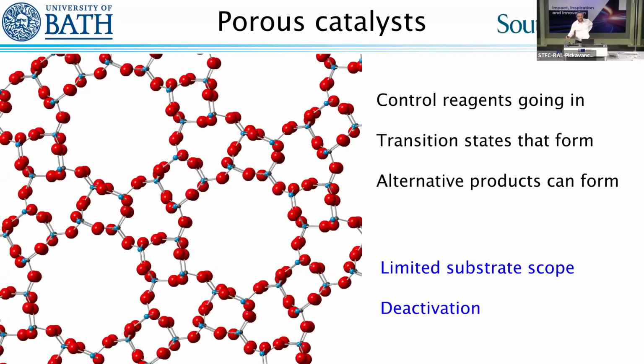So I'm going to talk about porous catalysts. This is some work I did at Southampton. I was at Southampton for quite a long time working on porous catalysts. So at this point, I think I'm legally bound to talk about it in every single talk I give. So the main thing we're talking about is microporous materials. We've heard talks about zeolites and SAPOs already in this conference. And this particular one I'm showing you here is SAPO-5.